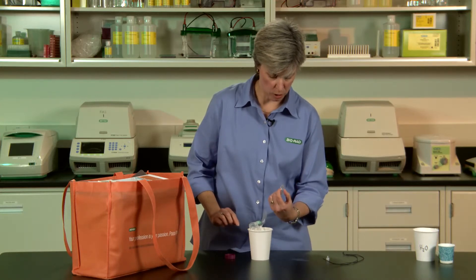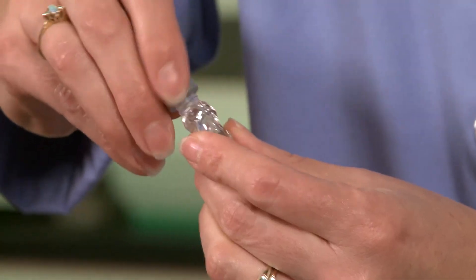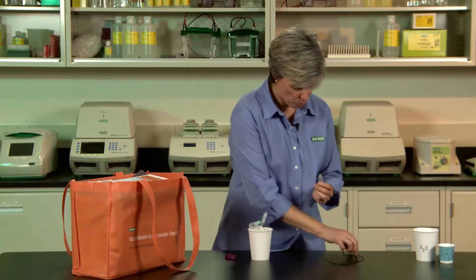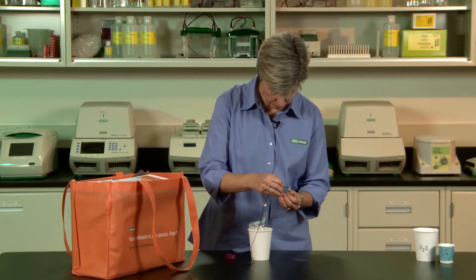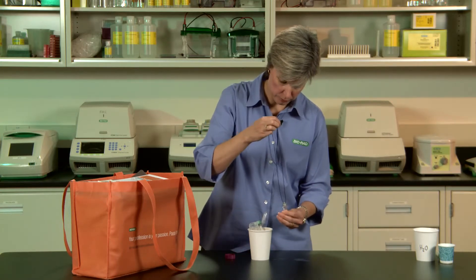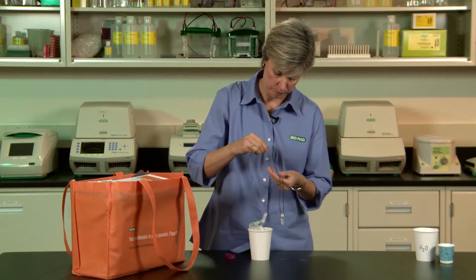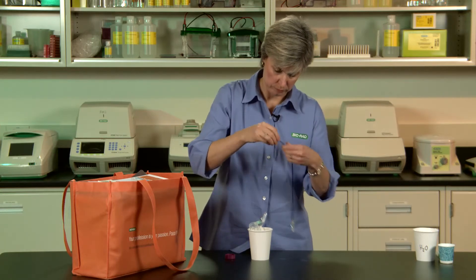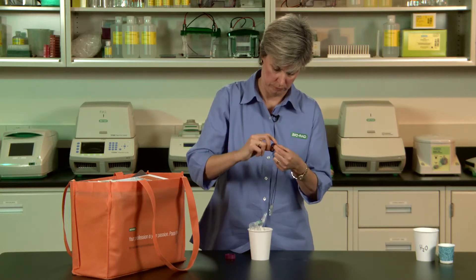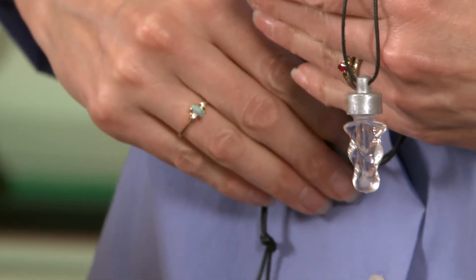They've added the DNA to the cool vial. Next step, put the cap on. We've also provided in the kit the black cord so they can complete their necklace — just thread that through and tie a little knot, and you're good to go. There you have your very own DNA necklace.